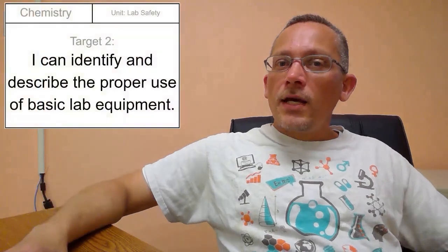Okay, so we've taken a look at the equipment, we've answered the questions. Hopefully that helps us to be able to describe the use of some of the basic lab equipment.